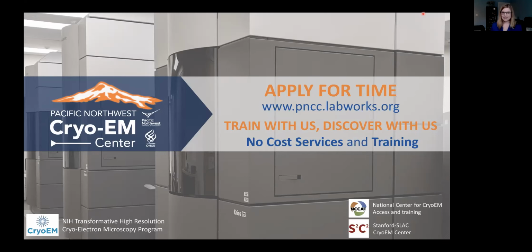At PNCC, applications are due every month on the 1st at 11:59 p.m. Pacific time. We leverage the EMSL user portal for all of our applications and proposal tracking. In general, it takes about 40 days for proposals to be reviewed and receive an award letter. Once approved, there's a recommended user onboarding with our user coordinator.